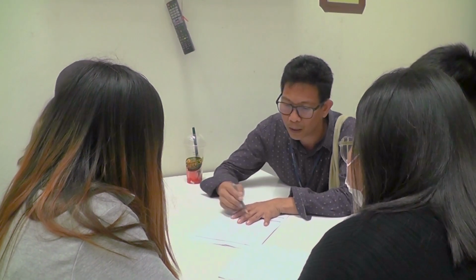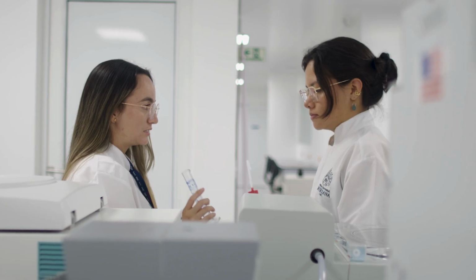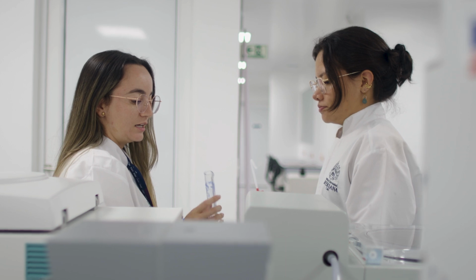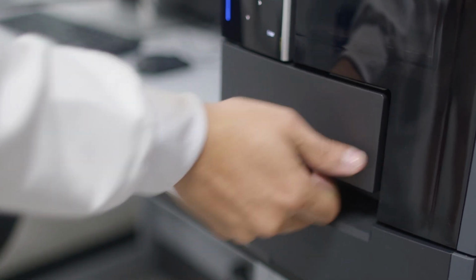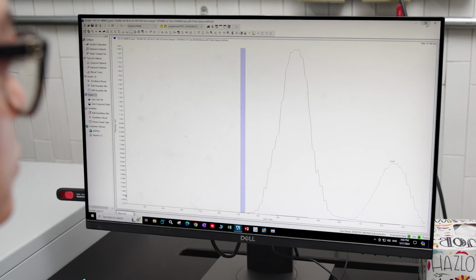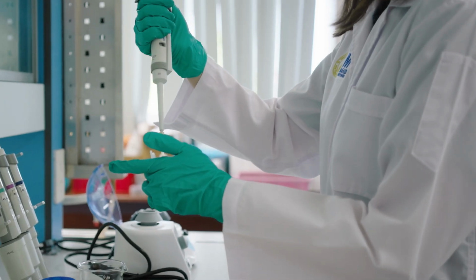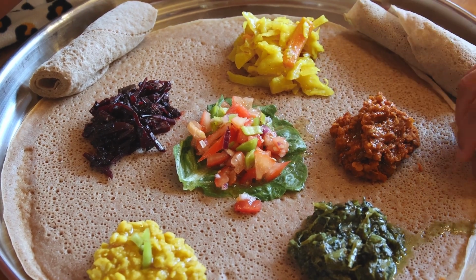The PTFI is interested in identifying this incredible diversity of lipids in our food. To do this, we use mass spectrometry, which enables us to identify and quantify lipids based on their mass and molecular structure. In this module, you will be provided with an overview of the functions and properties of lipids and a standardized protocol developed by the PTFI to analyze the lipid fingerprint of different foods.